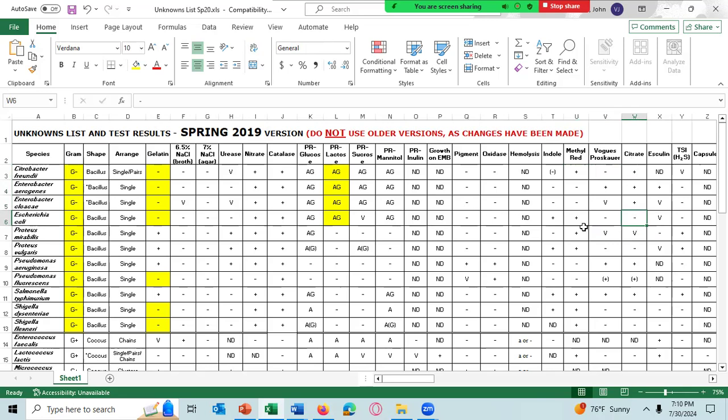Okay, so you look at the table and then decide which test to run, and then you request that test to me. And after the bacteria incubate, I will send you a picture of the test that you ask for. And let's say you ask for the citrate test and it's citrate positive, that narrows it down to 3. I chose that one just because it's 3. And then we continue, go further, and then you could do the VP test, for example.